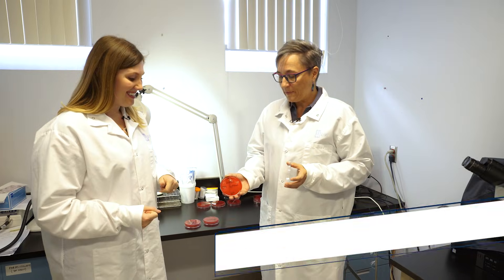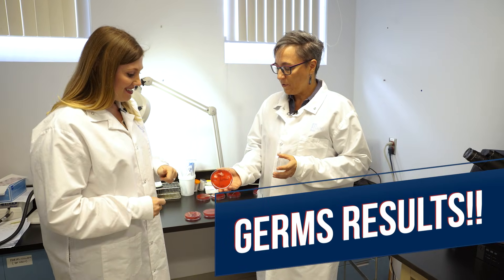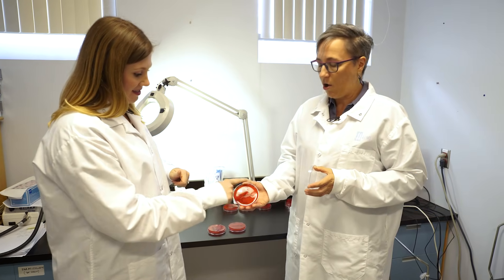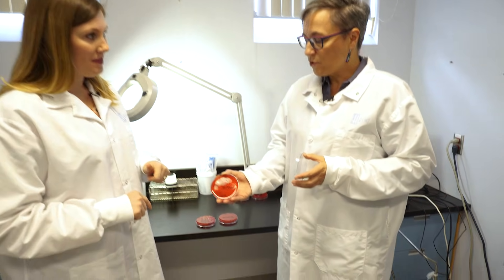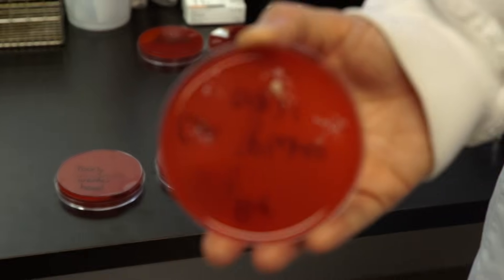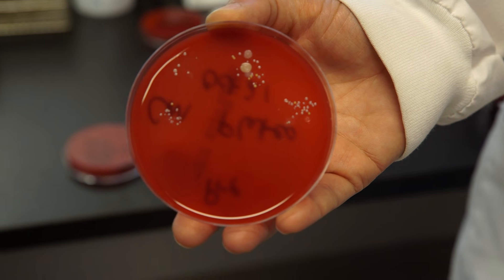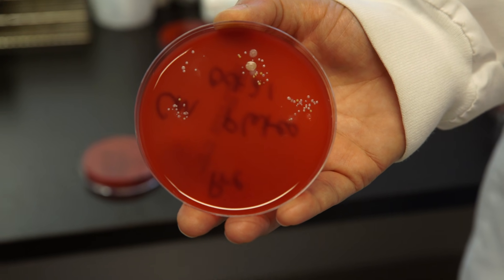This is our plate cultured before hand washing, and each of the little white spots you see is a colony of bacteria growing. Each of those spots started with one bacterium and has grown into thousands to millions of bacteria — so many that we can actually see them with the naked eye.